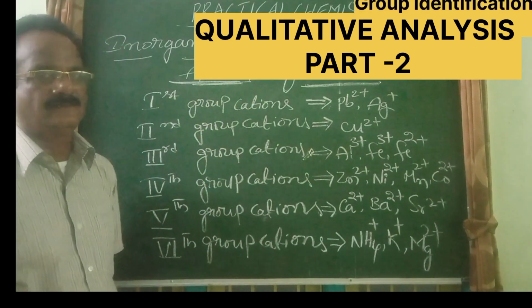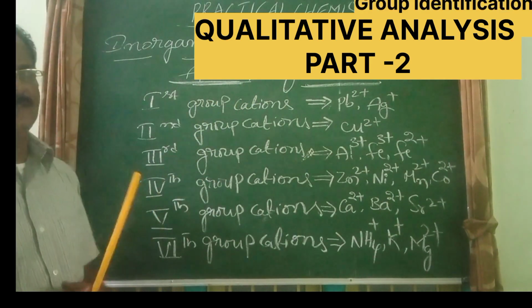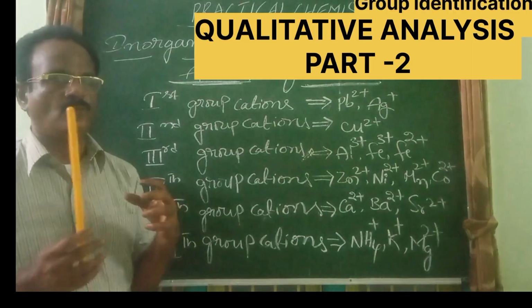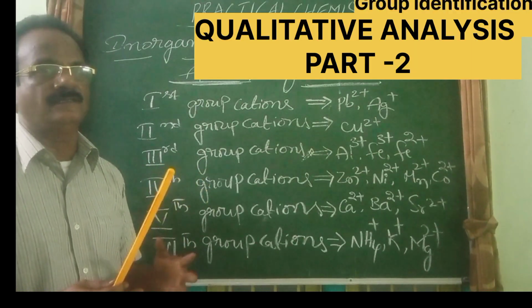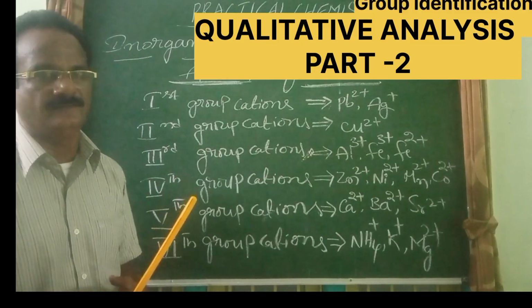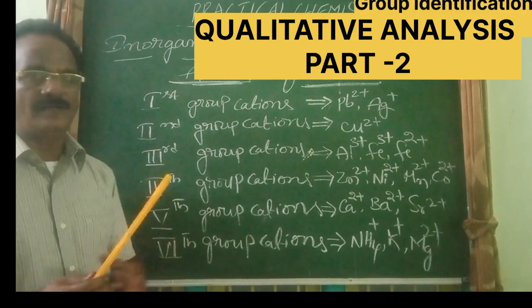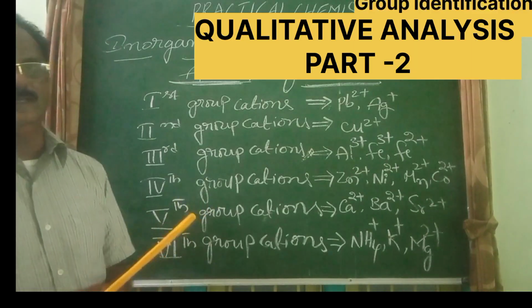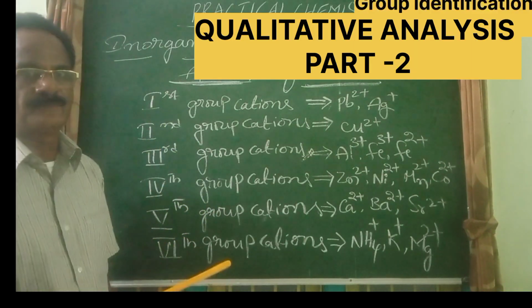Analysis of cations in mixture analysis. Before going to analysis, let us see what is the grouping of cations in inorganic practical chemistry. According to the systematic procedure, the cations are divided into the following groups.